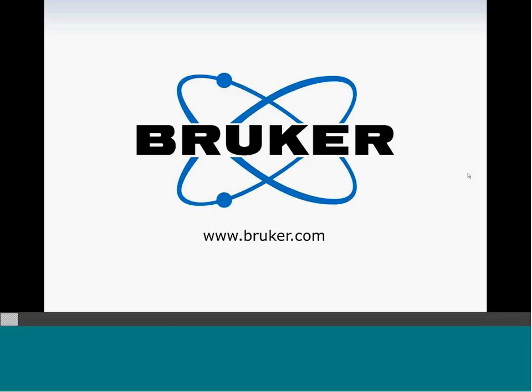Okay, great, thank you. Another question here: which technique, Raman or IR, is more suitable for chemical identification? Both techniques work well. It depends on the sample and the problem. If you don't want to open a container, Raman will be the best technique. If your sample is fluorescent, there's no way you can use Raman, and you need to switch to IR. So once again, it all depends on the sample.